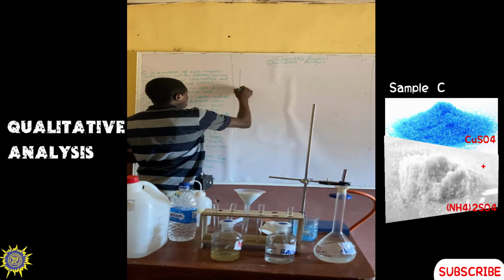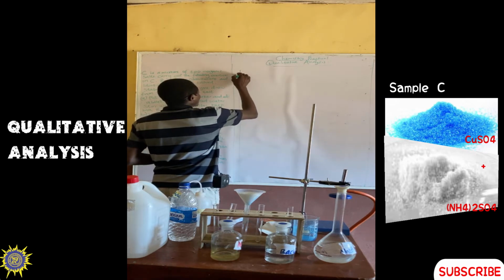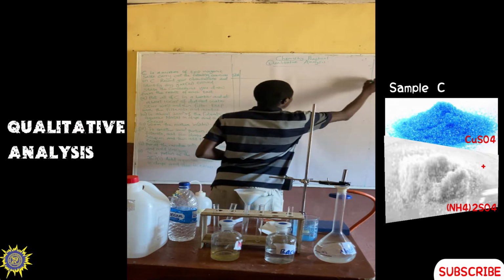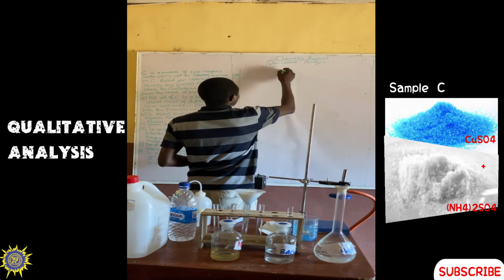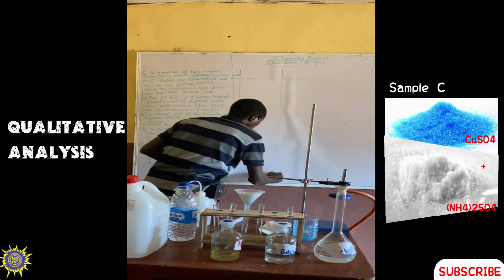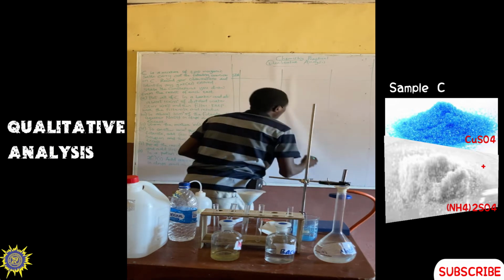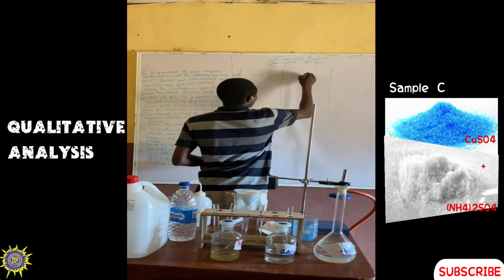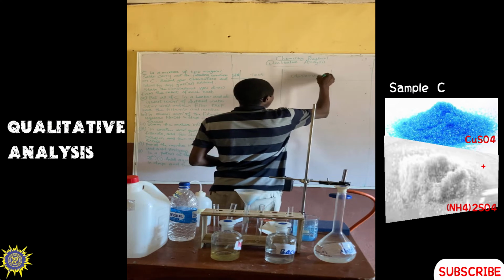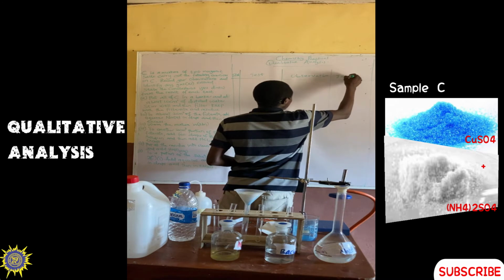So we have the column for the serial number, because your serial number must be in order to follow the work systematically. So we have the serial number, the test column, the observation column, then the inference.